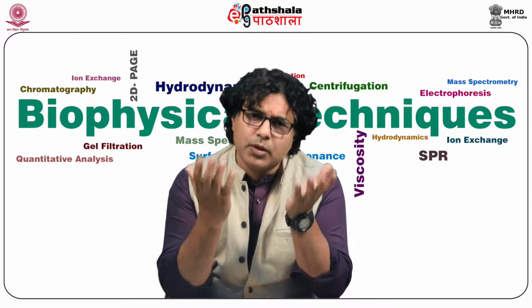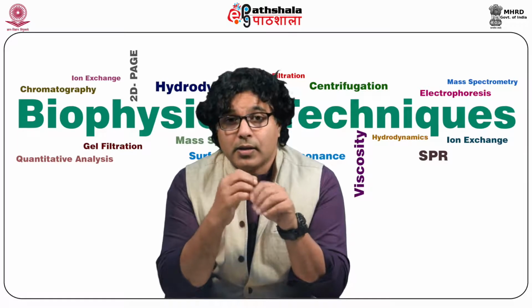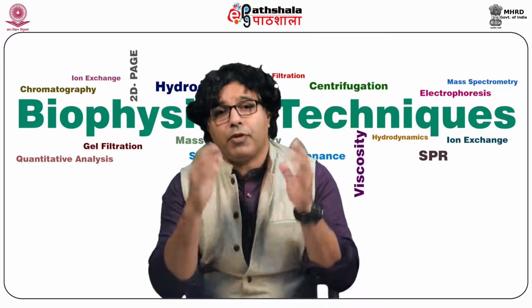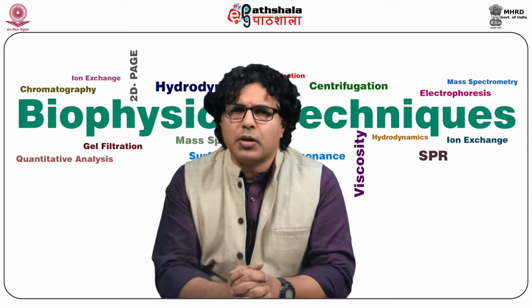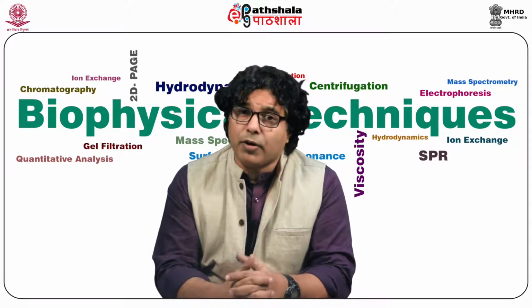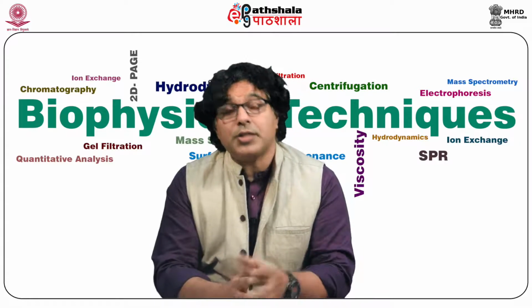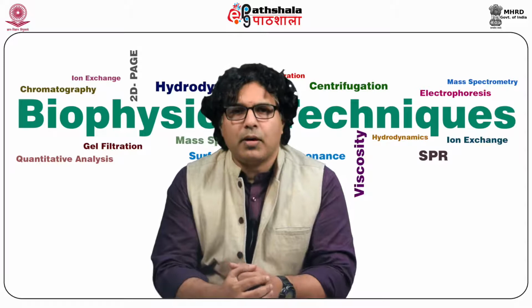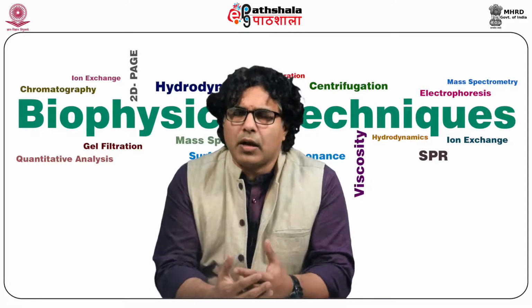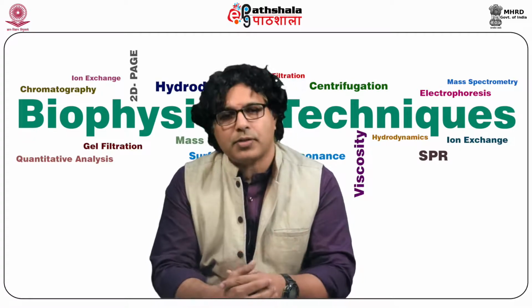There are some fundamental rules through which the separation happens. Today, separation science has become a very big area in which these HPLCs are commercialized. Apart from normal high performance liquid chromatography, today we have ultra high performance liquid chromatography, where the pressure tolerated has tremendously increased.